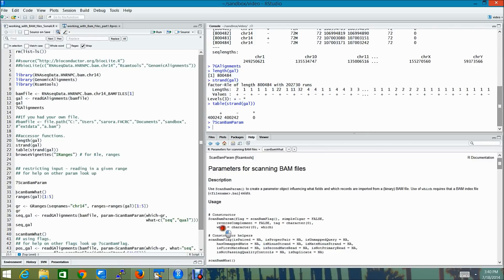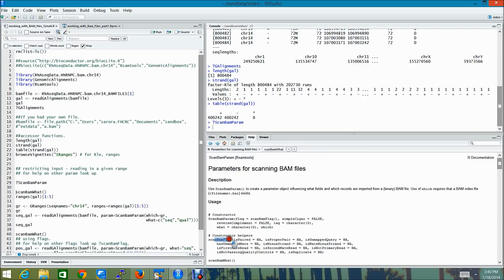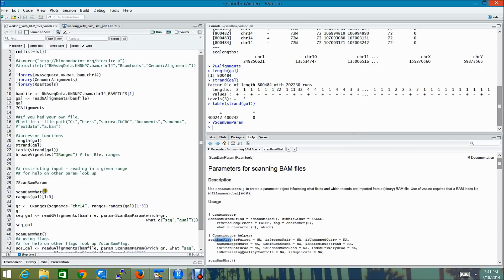Flag, on the other hand, can be specified using this constructor called scanBAM flag. It helps us specify whether the reads that we want to be read in are paired or not, have passed quality control or not, or are on the positive strand or not.